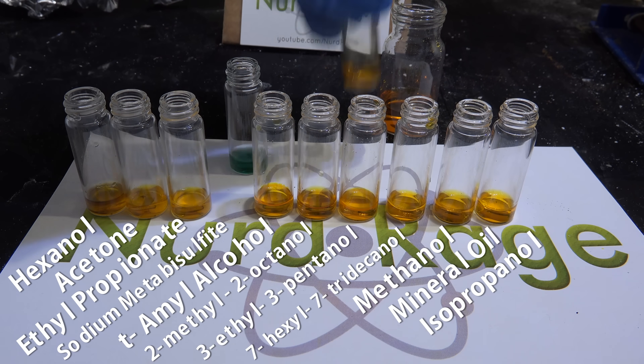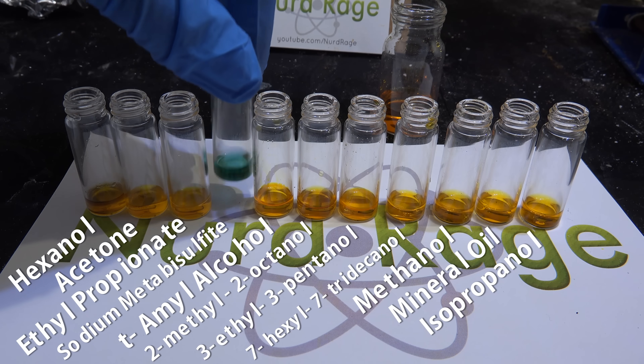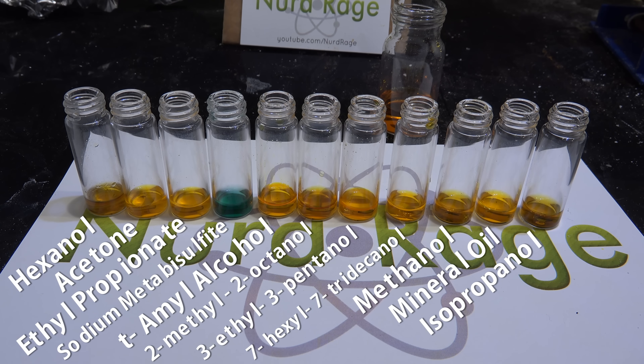I've added the test solution to all the samples. Our primary alcohols, hexanol and methanol, give a positive test, as well as our secondary alcohol, isopropanol. The primary alcohols react to give carboxylic acids while the secondary alcohols react to give ketones. Tertiary alcohols like the ones we made in our previous video on Grignard reactions can't form these products, so they should resist oxidation and remain unreacted — this forms the basis of our test.